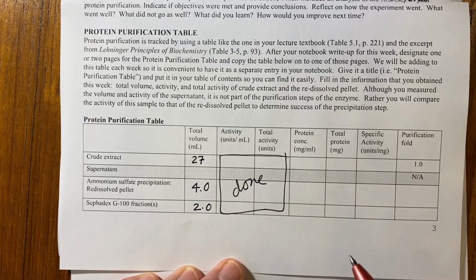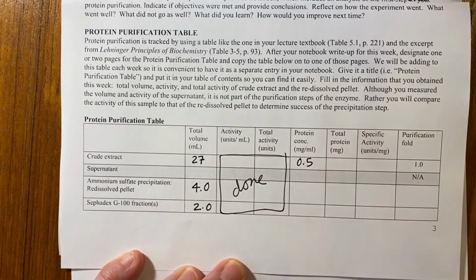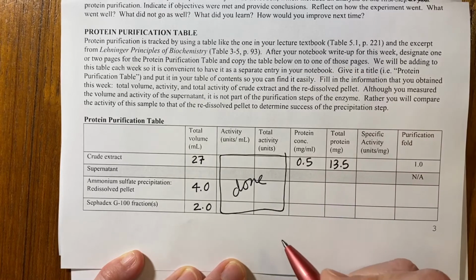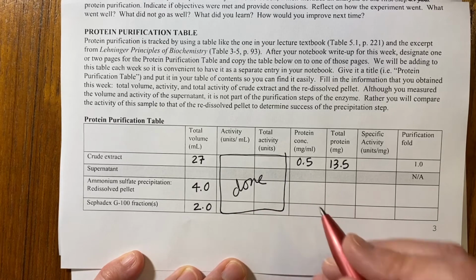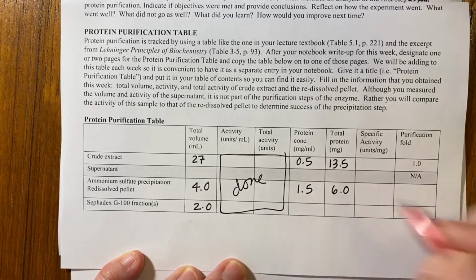So just for an example, let's say our concentration of protein was about 0.5. 27 times 0.5 is, I think, 14.5. Let's just do that. 27 times 0.5 is 13.5. And let's say our redissolved pellet was about 1.5. So then 1.5 times 4 would be 6.0 here.